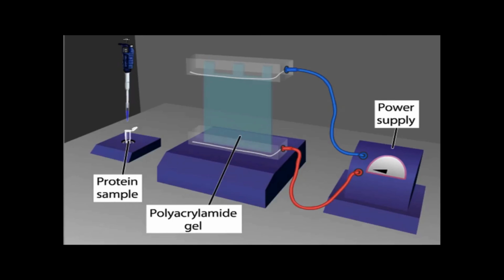So this illustration shows the setup of the polyacrylamide gel electrophoresis, or the PAGE. So as mentioned earlier, the gel contains acrylamide polymer or long chain molecules which cross-link to a certain extent. So let's just imagine that in this gel, we can find cross-links. And what is happening here is that the proteins present in the sample are first denatured with an anionic reagent.